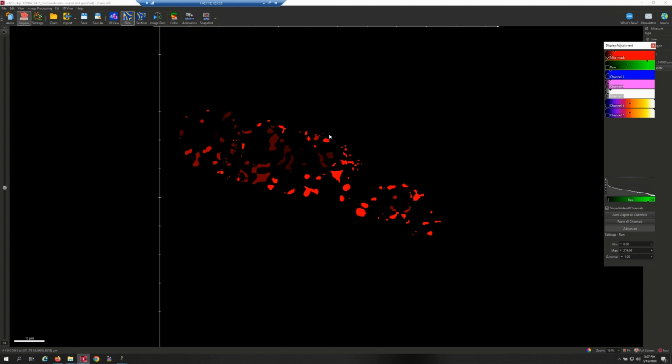You might not understand why there are different color intensities. This is because if you look, when the mouse hovers at the bottom left of the screen, this area will show the intensities of different channels. At this spot, you'll see that the intensity of the first channel is 82, at another spot, the first channel's intensity is 15.